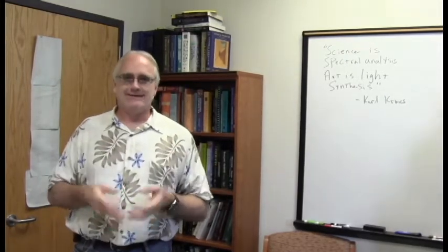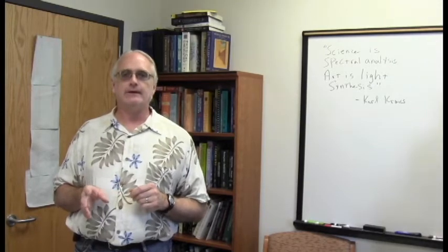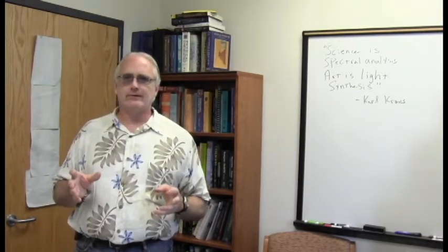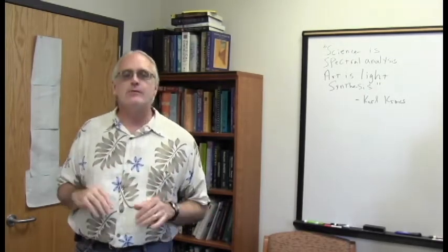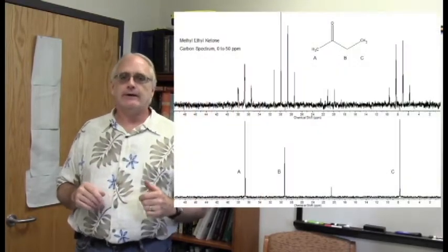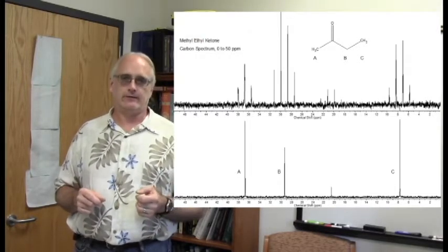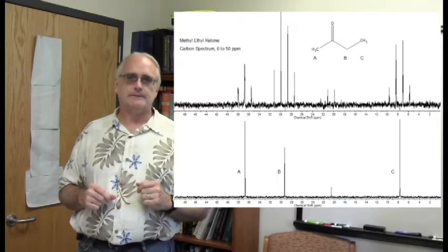If we did not decouple the protons that are attached to every carbon, we would take these really weak signals and chop them up into more pieces and spread them out over the spectrum. Look at the thing here. The quartet is spread out very wide. There's actually a large coupling constant between protons and the carbons they're attached to.